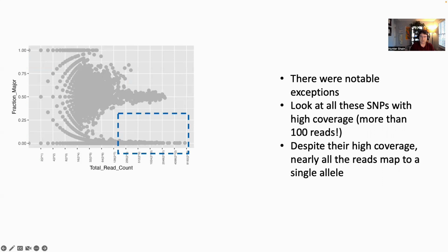So these are SNPs that map to immunoglobulin genes, and these SNPs were primarily expressed in lymphocytes or immune cells. It is well established that B cells, which of course harbor an allele from each parent, will undergo rearrangement, silencing one allele and resulting in exclusive expression of the other allele, encoding antibodies. And this is a mechanism so that each B cell only expresses a single antibody.